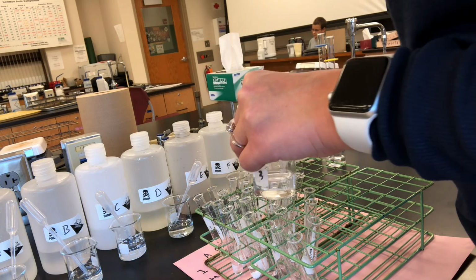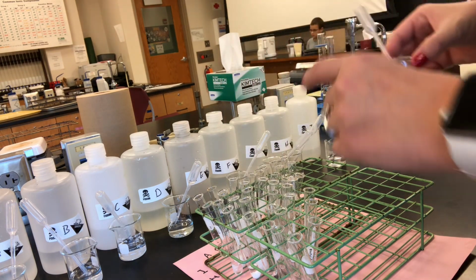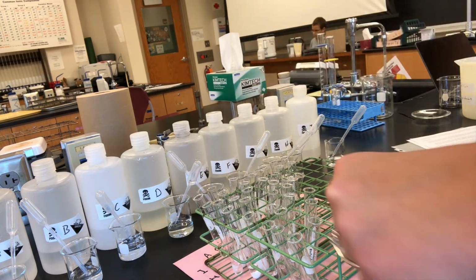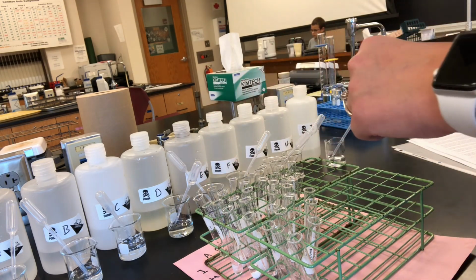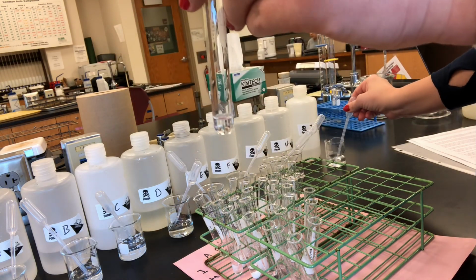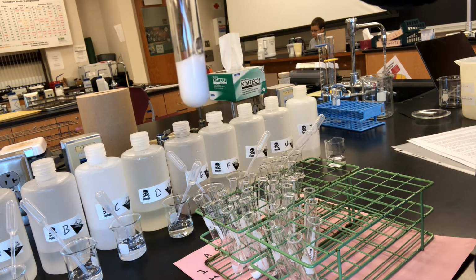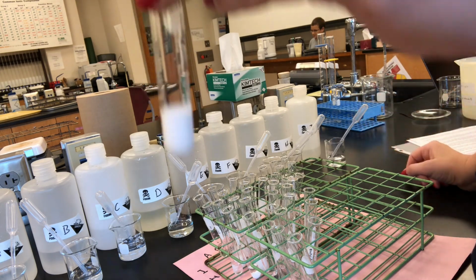It shouldn't be super long. It's figuring it all out. Take the time on this one. All right, so E. Got E, and now I'm going to add I. E and I: milky white precipitate formed.